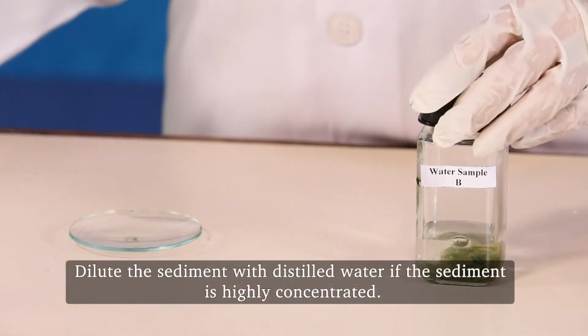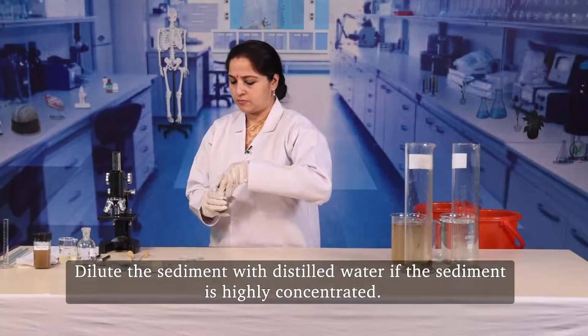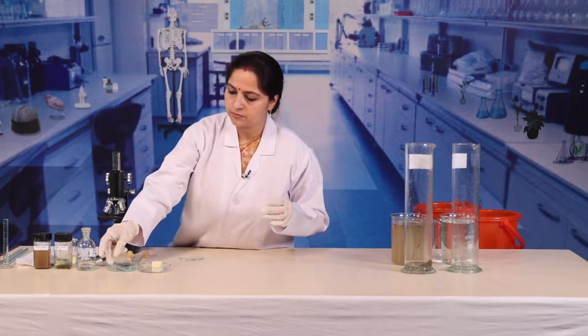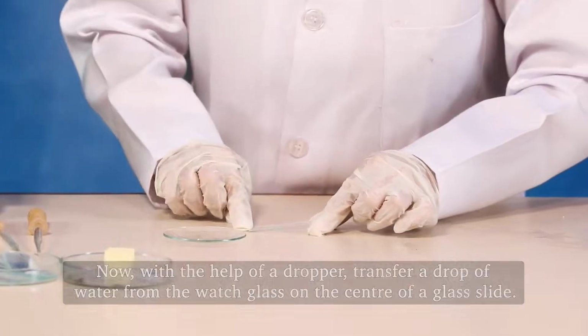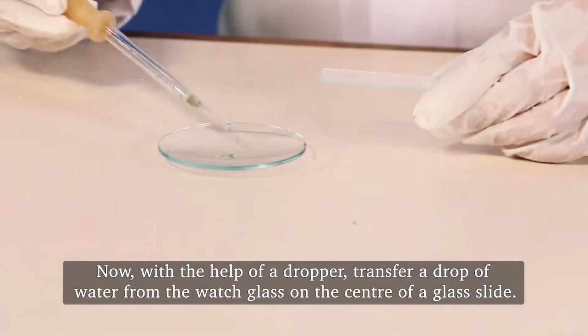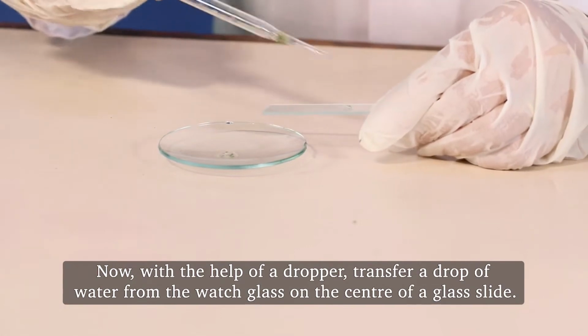Dilute the sediment with distilled water if the sediment is highly concentrated. Now, with the help of a dropper, transfer a drop of water from the watch glass to the center of a glass slide.